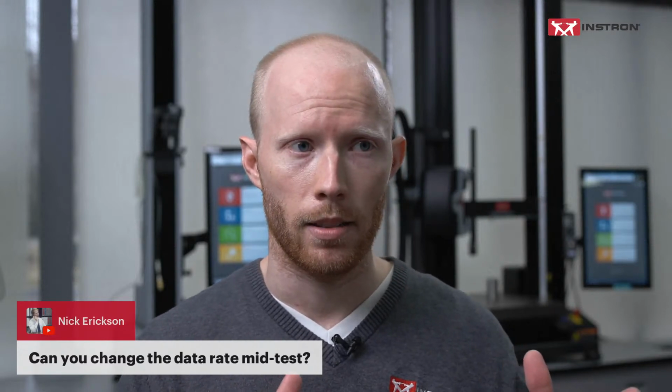So you could be doing a lot of preconditioning that might take 5 or 10 minutes, and you don't want to capture any data to save on your file size, but then you might have a step that takes 5 seconds after all of that where you want to capture a lot of data. That would be a way that you could change it in the middle of the test.